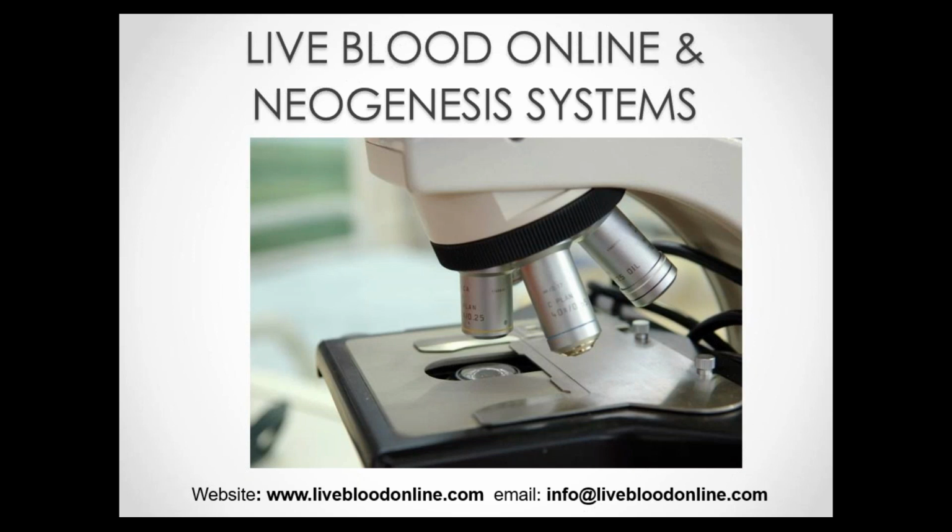The next question is, how close is live blood analysis to normal medical hematology? Well, this is actually quite an interesting question, because, as I said earlier, a fair degree of information in live blood analysis is purely based on standard hematology. So in terms of the specific anomalies that we also see and recognize in conventional hematology, the interpretation would be very similar. So from that perspective, it is very similar to conventional hematology.